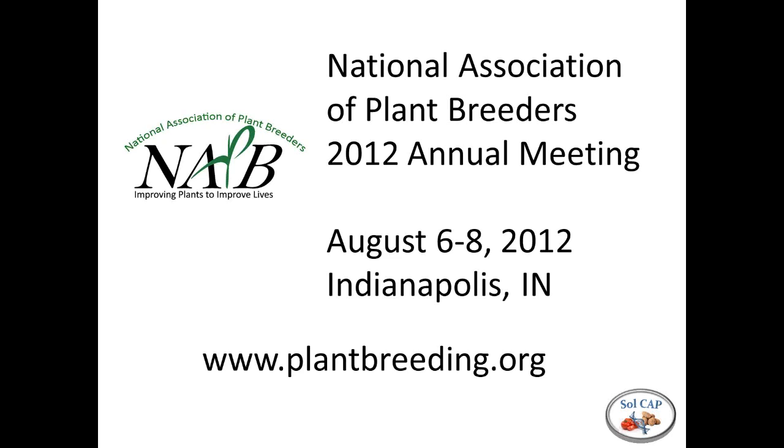I don't think there's a cutoff, but there's probably a functional cutoff where, if you have 70% missing data, of course you're not going to use it. But there's a point where all your linkage groups aren't going to make any sense anymore. So the results are going to basically tell you that you've got a problem. I think the program will function, but your results will be undesirable. Right, and you're going to need to use your judgment and your insight.